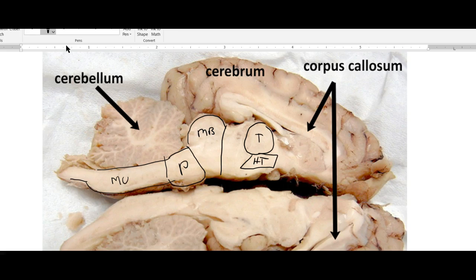So it's right in here where my neuroanatomy is a little rusty. I don't know exactly where thalamus and hypothalamus end and midbrain begins. But this lump right here is definitely midbrain. And that little groove right there that you can see, which there's more of here, that's your cerebral aqueduct, which runs right through the midbrain down to here, which is where your fourth ventricle would be, except this is all collapsed and you can't really see the fourth ventricle. That's a little bit of it right there too. Fourth ventricle.